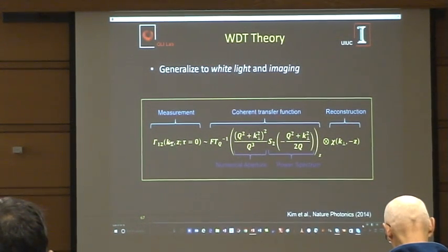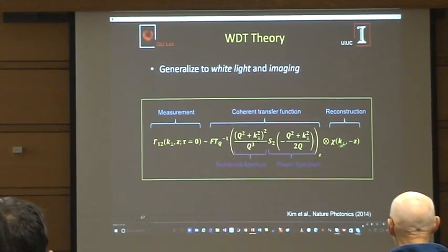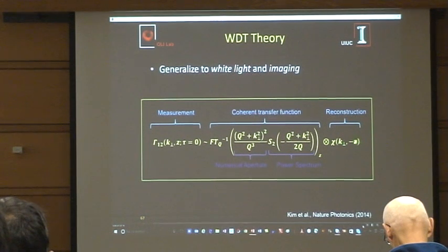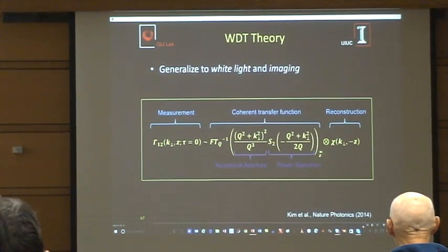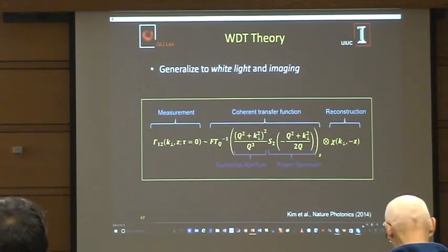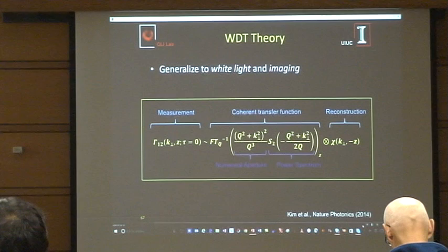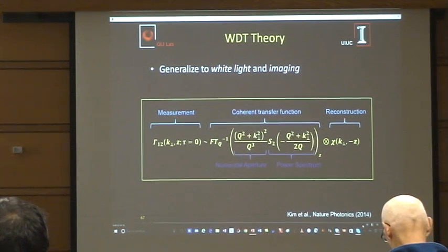So essentially, this is the data, this is your object. Imagine this is a refractive index distribution. It's in transverse spatial coordinate, spatial frequency, and Z. So notice, the smearing in Z, the blurring, is done through this convolution operation. And basically this function, the system function, has two terms. One, due to the spectrum, so this S right here. That tells you that the broader the spectrum, the better sectioning you have, which we know. And the second one is just numerical aperture, meaning the higher the magnification of your objective, the better you are. So that also makes sense.